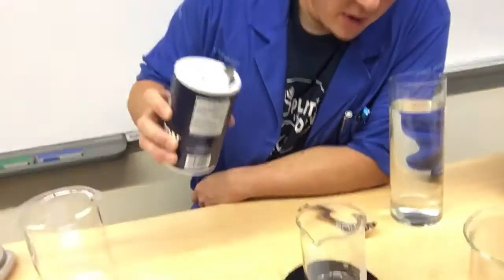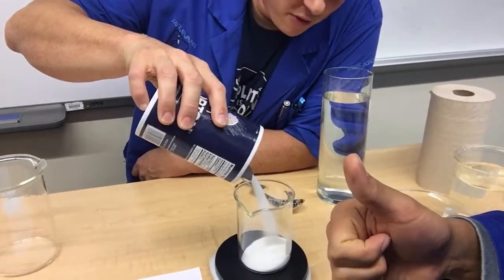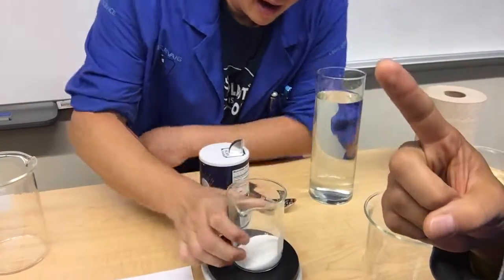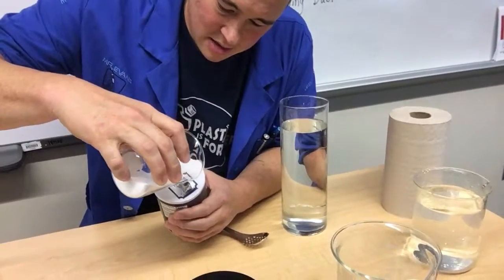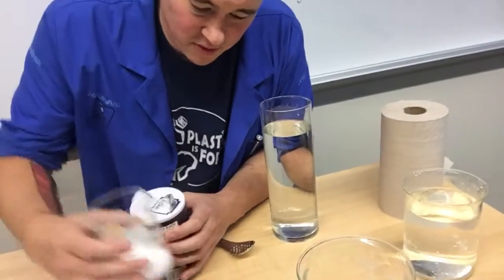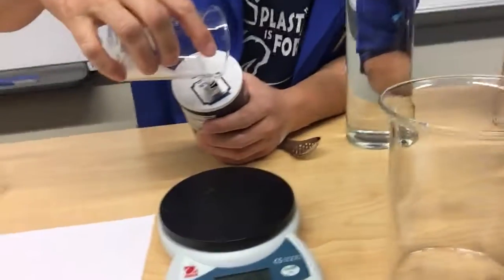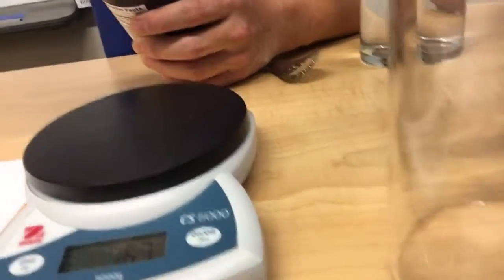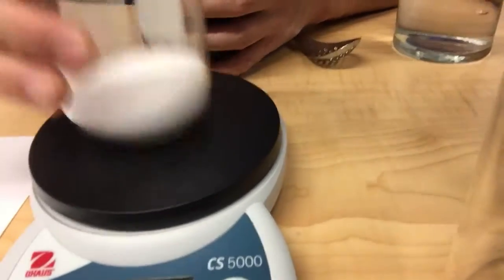So let's get started. First of all, we had our salt. We had, I think, 50 grams in all the classes. So we're gonna make two of these. We're gonna make one for Mike. Let me put some of that back. So we need 50 grams in each. That's 66. Get rid of some. Scientists make sure that they measure correctly, so that's why we're trying it so much.